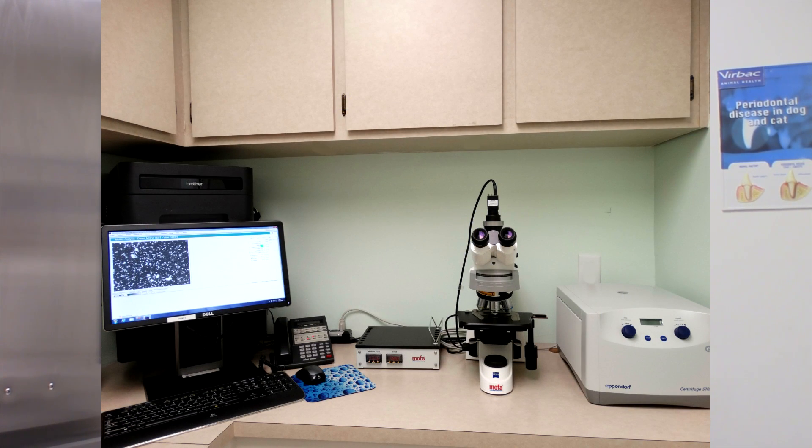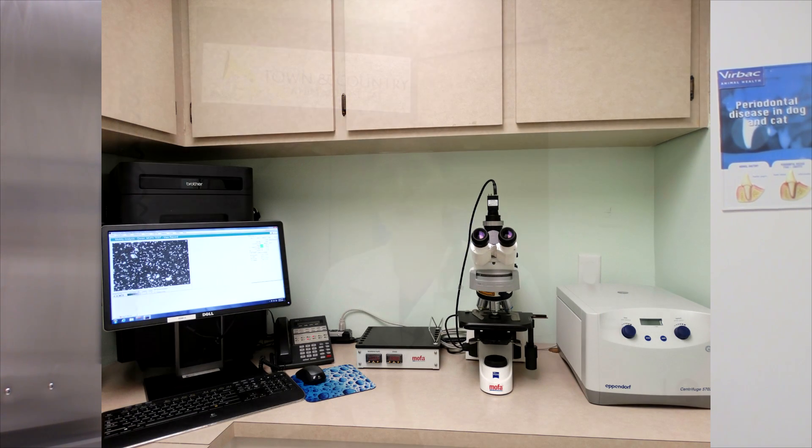The next thing we do here — and we're fortunate to have here at Town & Country — is a CASA, or Computer Assisted Sperm Analysis. There's only about 60 in the country, so we're really fortunate to have it here. Most of those are at research centers or at vet schools.